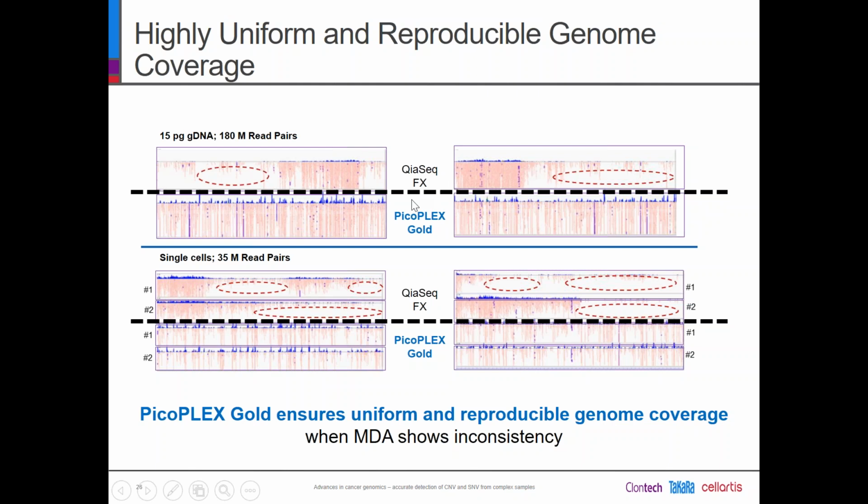So what we did is compare PicoPLEX Gold with another chemistry, one of the leading ones on the market, MDA, multiple displacement amplification.